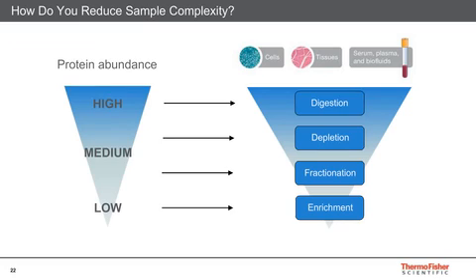These additional processing steps can introduce more variability among samples, which contribute to decreased reproducibility and poor quantitative measurements. In addition, digestion of proteins to peptides for bottom-up proteomic analysis greatly increases the sample complexity, which results in no or poor sequence coverage for low abundant proteins.